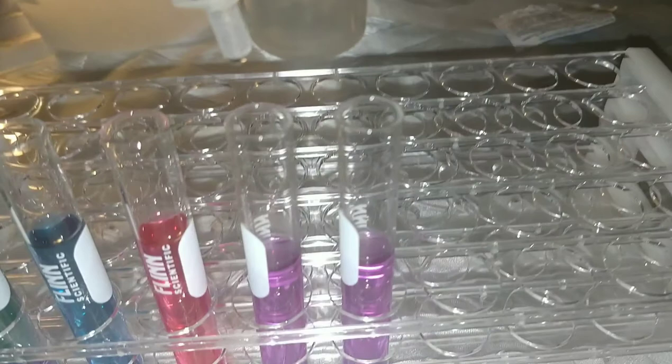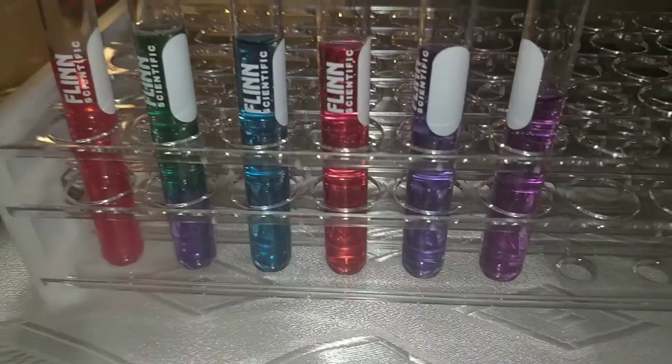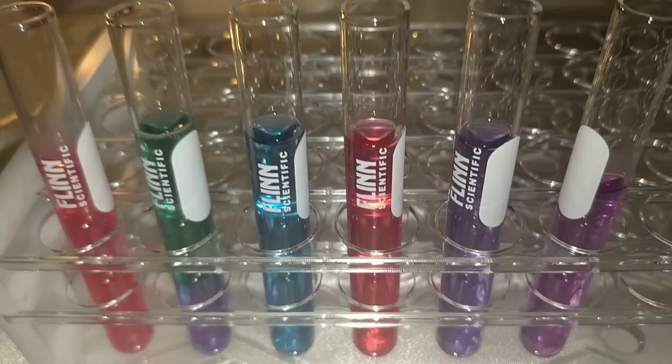Next I'll test the antacid — adding it to the test tube. It turns darker purple, a bluish-purple. I'll write that down.